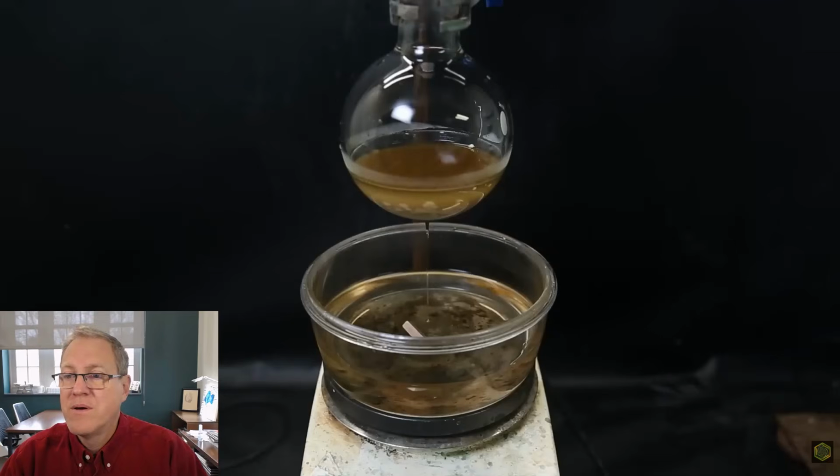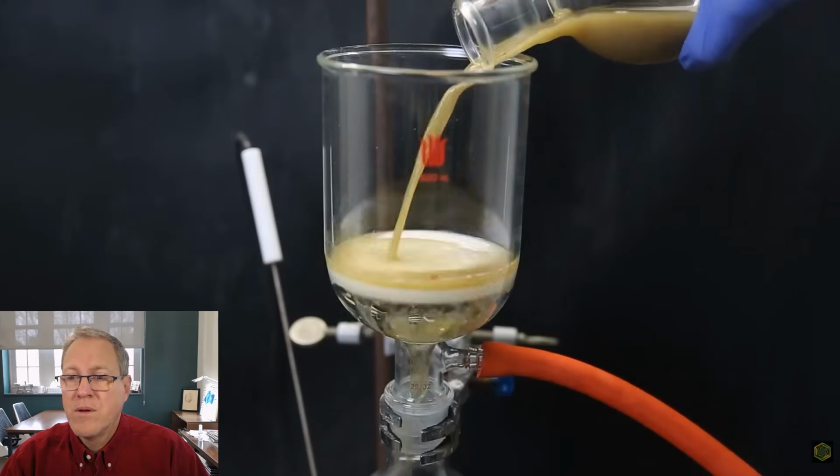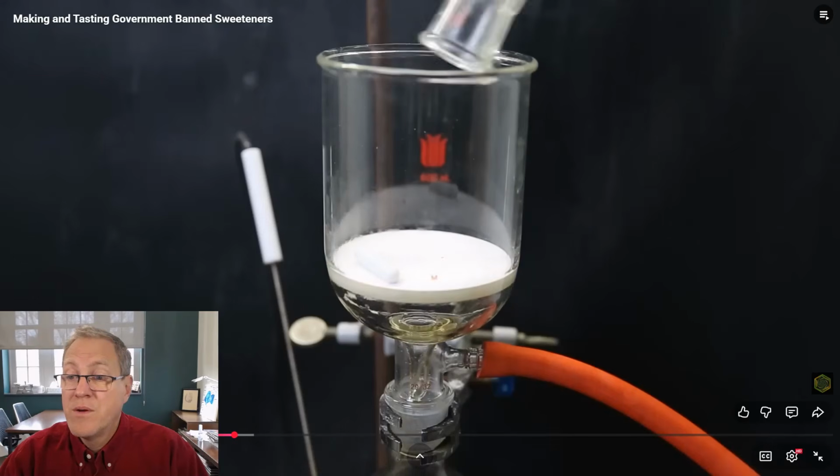So take the flask off heat, and then set it up for vacuum filtration, to filter out the precipitated sodium bromide. In the previous reaction, this was filtered to collect the product. But now we want to remove the solids because our product is still in solution. So sometimes you filter because you want the solid, sometimes you don't. It's left on the filter as a white solid.